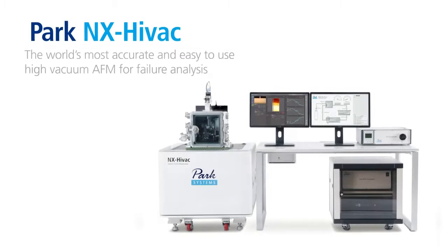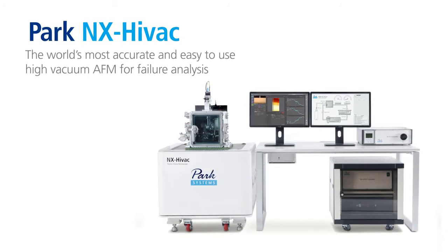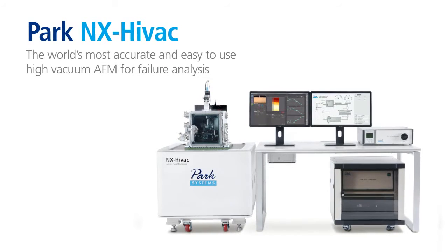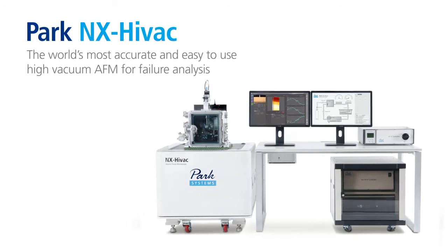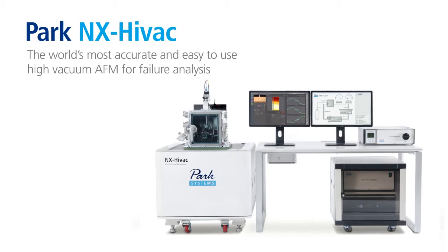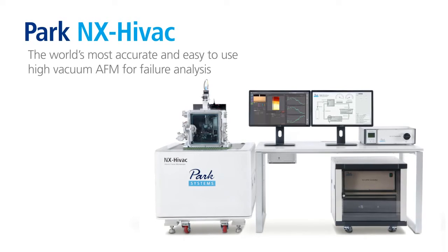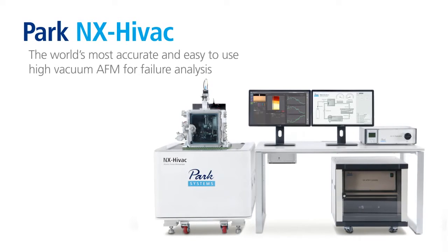With its core functionalities centered on accurate AFM imaging and user convenience, the PARC-NX HIVAC High Vacuum AFM System is the most powerful way available to address your needs and increase your productivity.